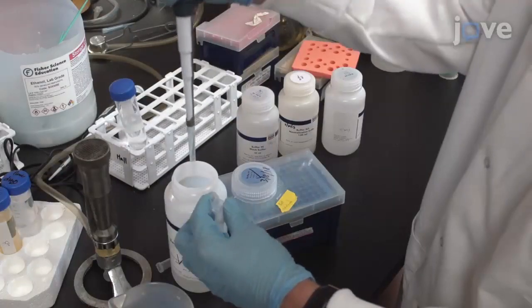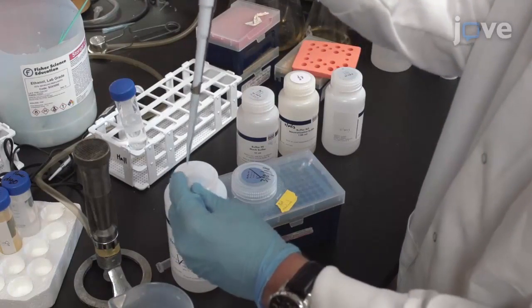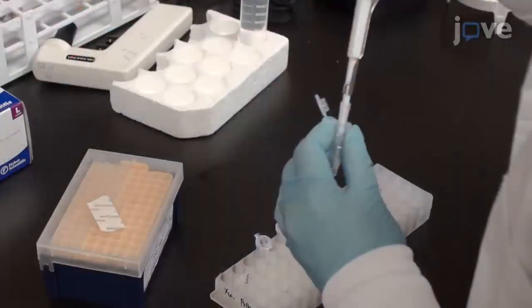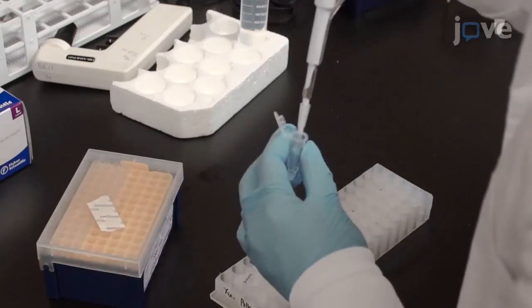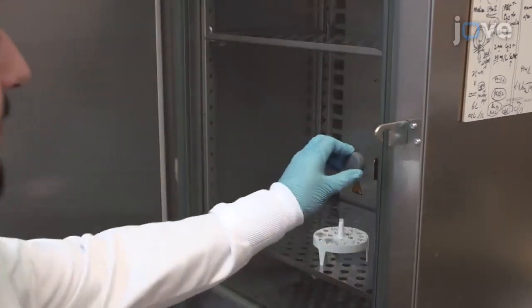Add 10 microliters of a ligation reaction mixture containing 1X T4 DNA ligase reaction buffer and 5 units of T4 DNA ligase to a fresh 1.5 milliliter Eppendorf tube. Then, add 100 nanograms of the linearized vector DNA and 400 nanograms of the digested DNA fragment. Incubate at 16 degrees Celsius for 16 hours.